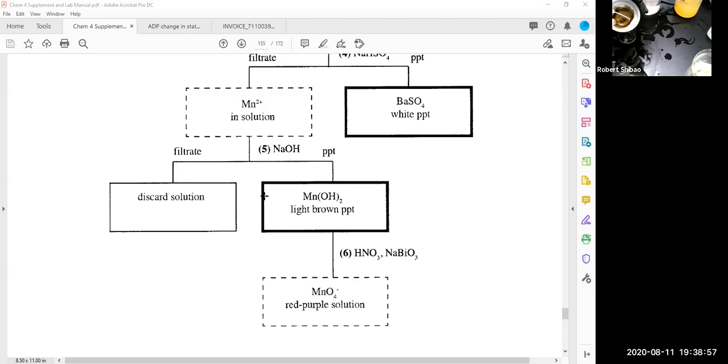Do you see some vapors coming out there? When you see vapors, you should do this in the hood. Actually, I'll probably just test it in here. A lot of it didn't dissolve. I'll test two. I'm going to test the solution there.